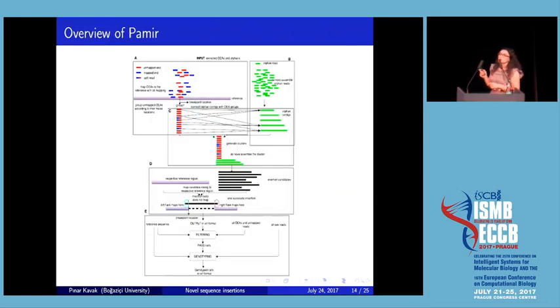To recap, we start with extracting one-end anchors and orphan reads from the best alignment output. We multi-map one-end anchors. We assemble orphan reads into orphan contigs. We find an association between one-end anchors and orphan contigs. We generate the clusters. We assemble the clusters and map the resulting insertion candidates to the reference to obtain the insertion breakpoint location and insertion content. We apply post-processing operations, and finally, we genotype our calls.